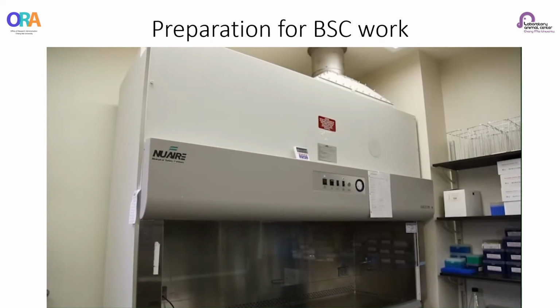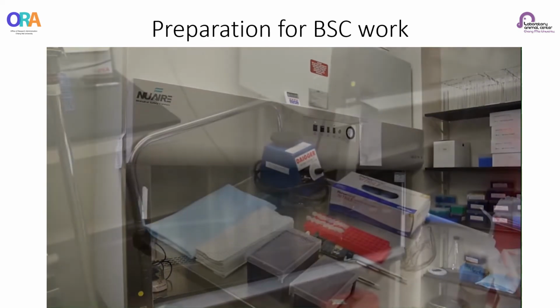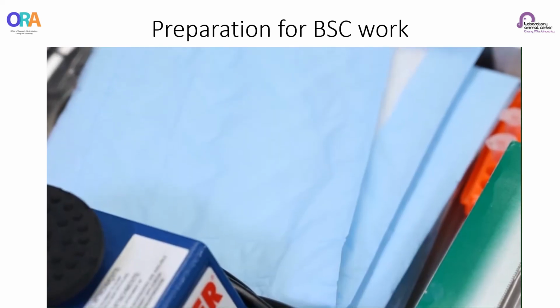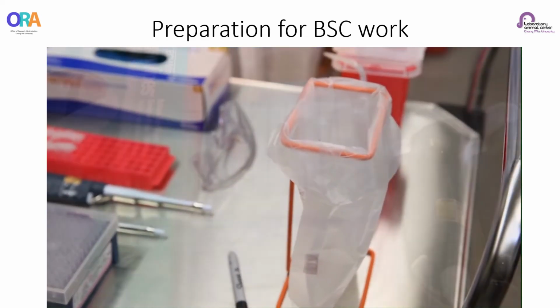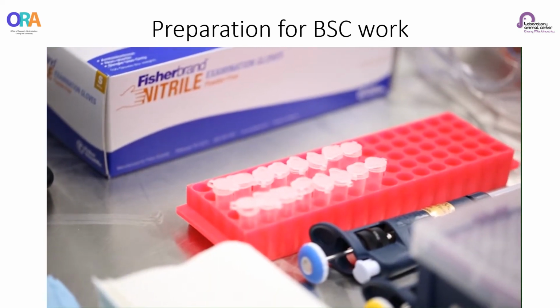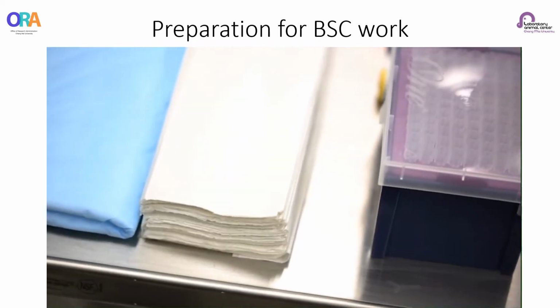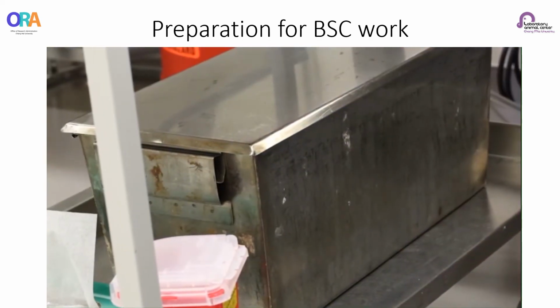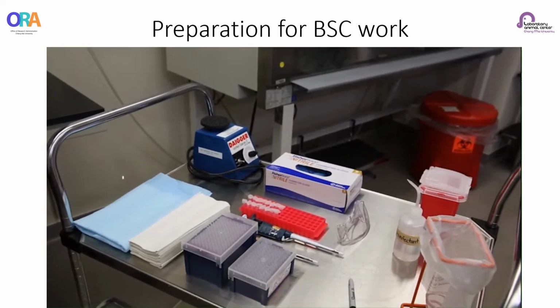Prior to starting work in a BSC, schedule uninterrupted work time if possible, and collect all of the laboratory materials that will be needed, such as absorbent pads, a biohazard waste container, pipettes, pipette tips, microfuge tubes, a vortex, a small sharps container, paper towels, and whatever else you may need. Place these materials on a cart next to the BSC.